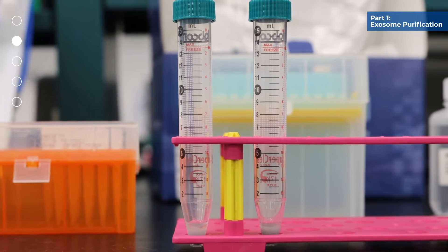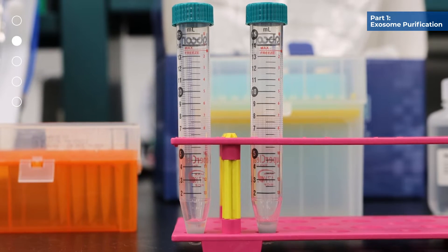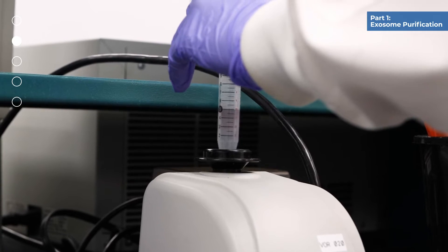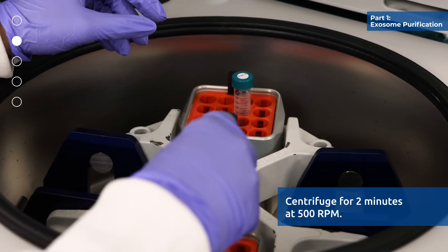Incubate the slurry pellet re-suspended in the 200 microliter exo R buffer at room temperature for 5 minutes. After incubation, mix well by vortexing for 10 seconds. Then centrifuge for 2 minutes at 500 rpm.